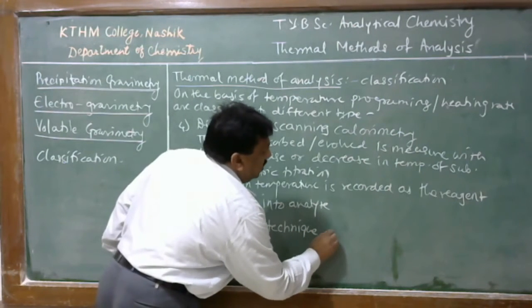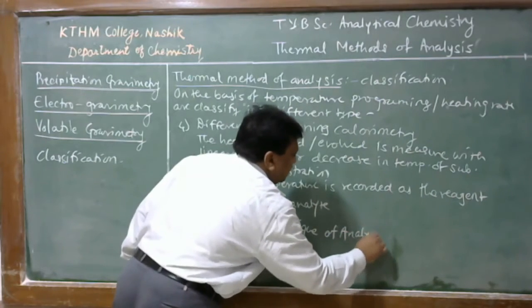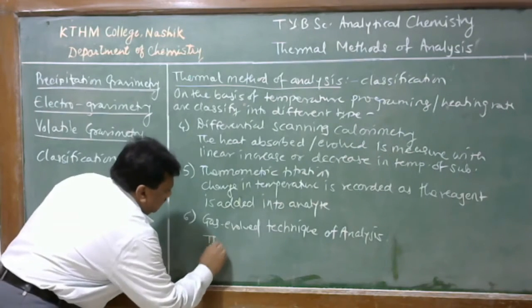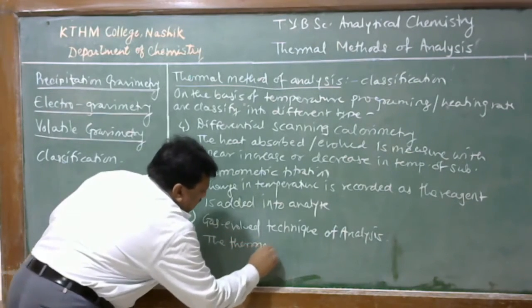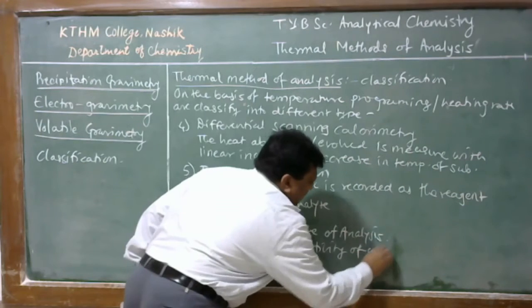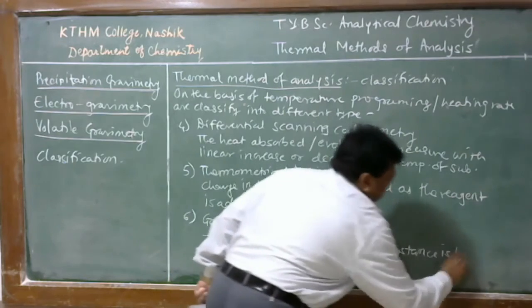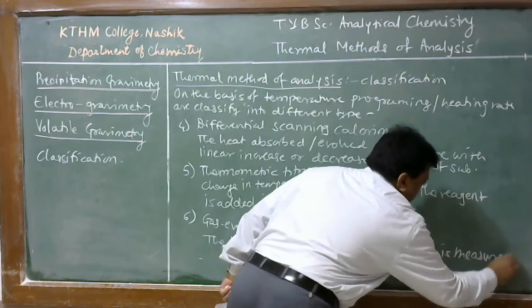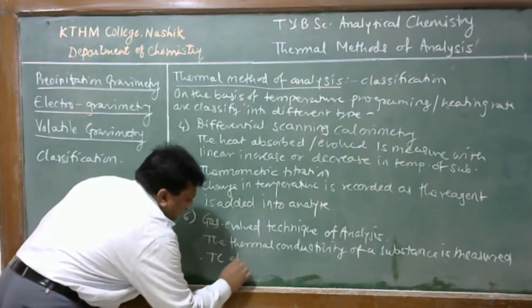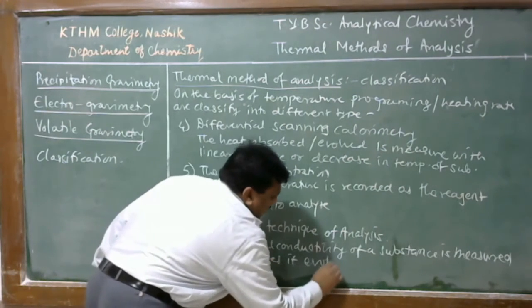In this case, the thermal conductivity of a substance is measured, and it decreases if there is evolution of gas.